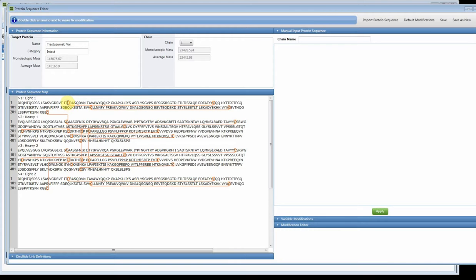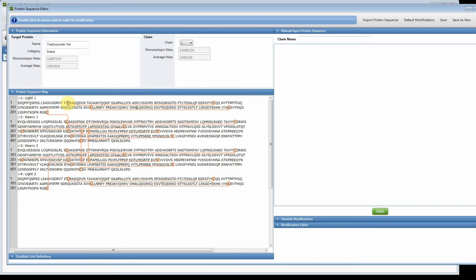You need to link the disulfide bonds together. When you do that, you click on a cysteine and you can create a link, bridge the link, or reboot the link. I've already linked them together — you can see the red lines. By doing this, you're actually reducing the mass of the intact protein. When the software does the annotation for intact, the target protein mass must be close to what the protein you're interested in minus any variable modifications. If we did not link these 16 disulfide bonds, the mass would be heavy by 32, because linking the disulfide bonds removes two hydrogens. So you need to make sure that you link the appropriate disulfide bonds if it's non-reduced, and then you get the average mass for the target protein as the non-modified version.